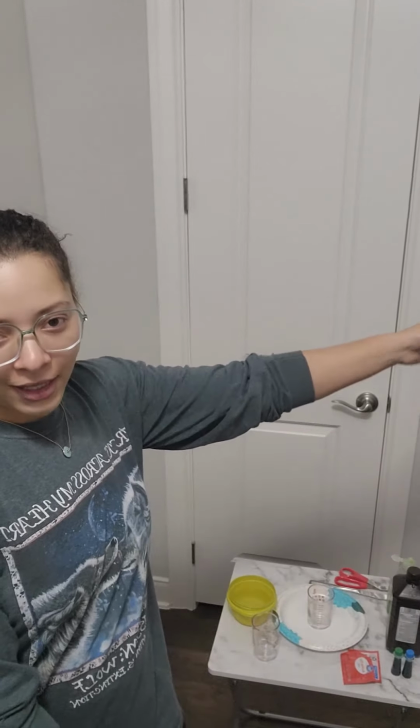Anyway, welcome to week 4, our interactive discussion in which we will be doing an elephant toothpaste lab. I have today's lab set up. Don't know if you can see it. Readjust a little. There we go. So I have everything for today's lab.